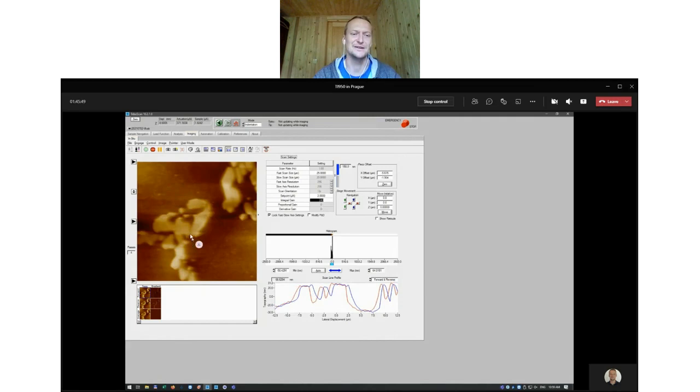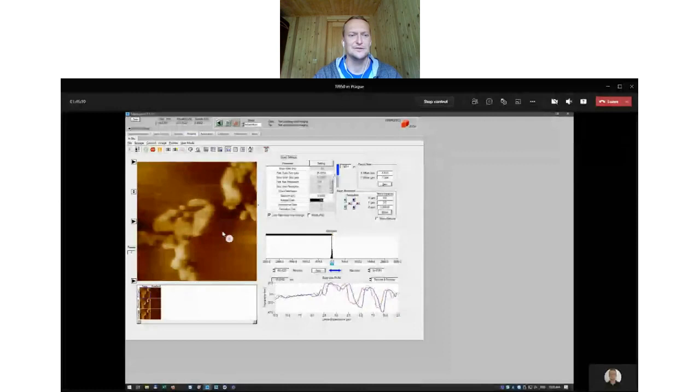Initially, where it all started, we integrated our sensor that measures force and displacement into an AFM platform. And this idea of scanning indentation has always gone with the Hysitron instrument. Now these standalone platform systems have a scanner, and our transducer is mounted directly to the scanner. That allows us to do a topography scan before we do an indentation. We use a piezo scanner to go along the sample surface at low contact force. Currently we use 2 micronewton contact force with the same tip that we are going to use for indentation. So we don't need to move anywhere.